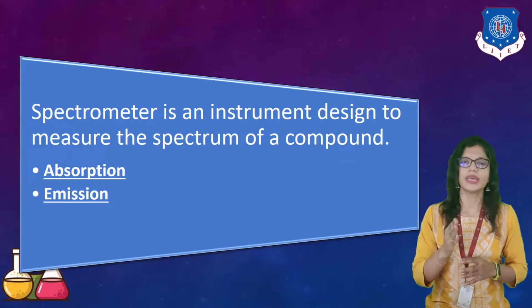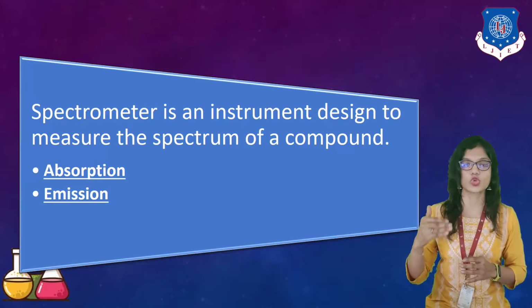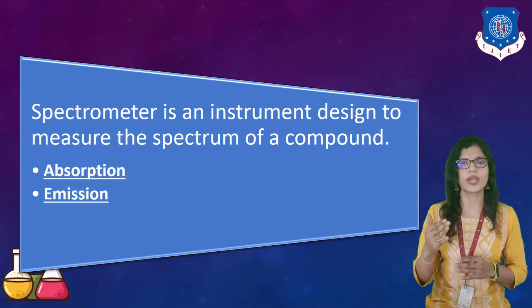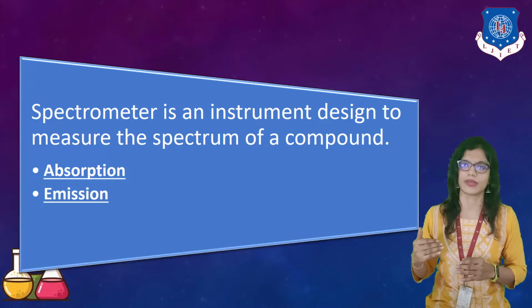Generally, the technique is known as spectroscopy. The method is known as the spectroscopic method. The instrument is known as a spectrophotometer or spectrometer, right?